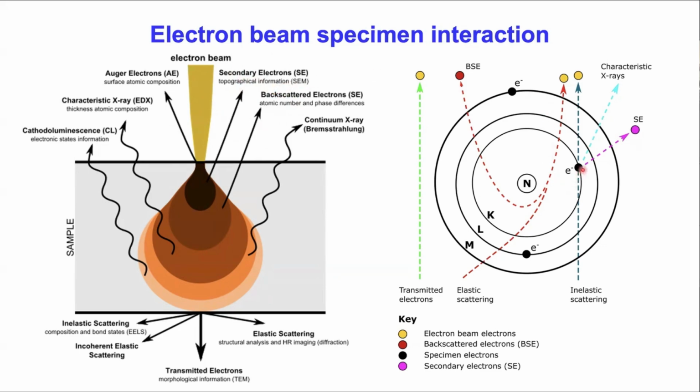The secondary electrons are those produced from your sample. Then the backscattered electrons, the same electrons returned back, give the elemental information of your sample. So the basics are that these are the electrons which can be used for imaging in scanning electron microscopy.